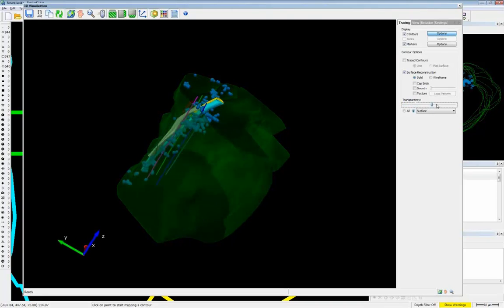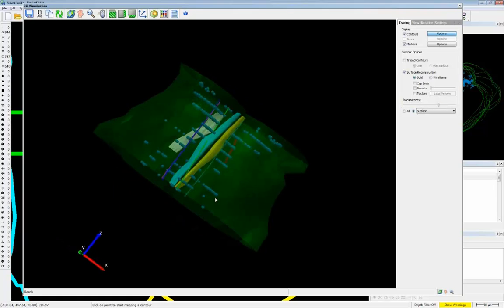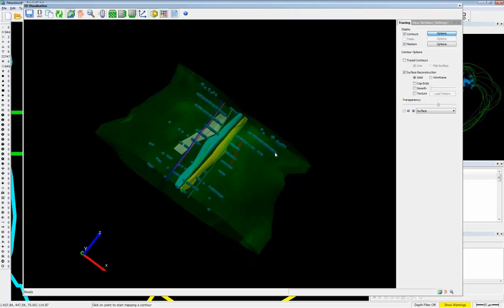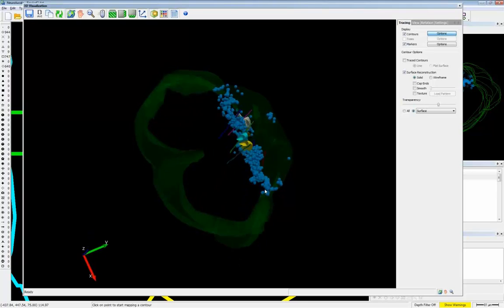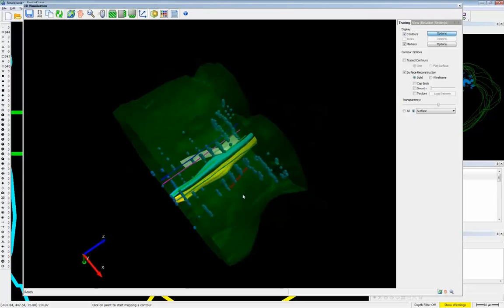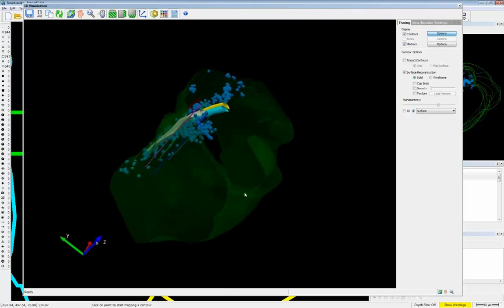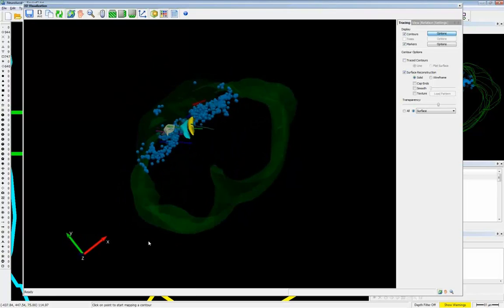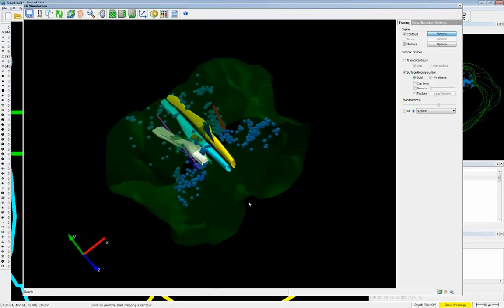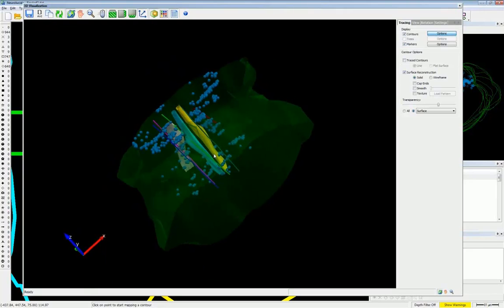So now you get a crystal clear view through here, and you can see all your markers in the different sections. So you get the context of the section, but you are able to see clearly the data that you're trying to represent with this model, so the location of those cells of interest and the various white matter tracks that have been traced. It's just so much easier to see what's going on rather than a pile of contours and simple markers.